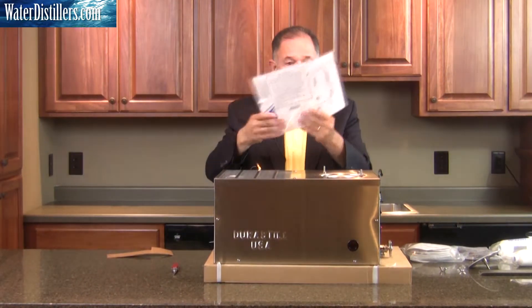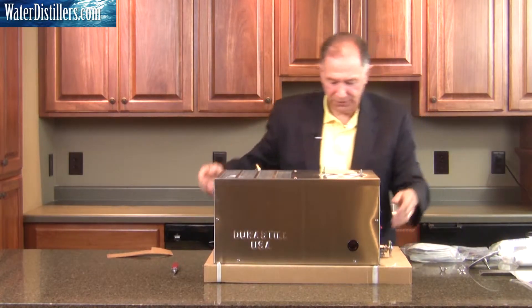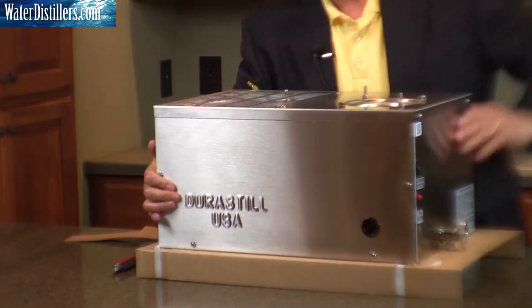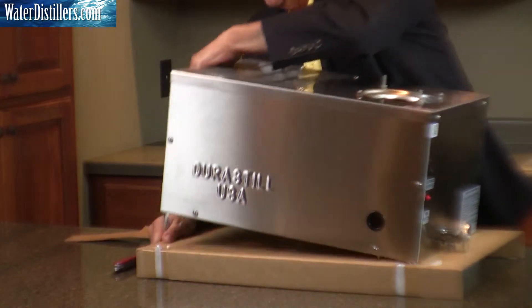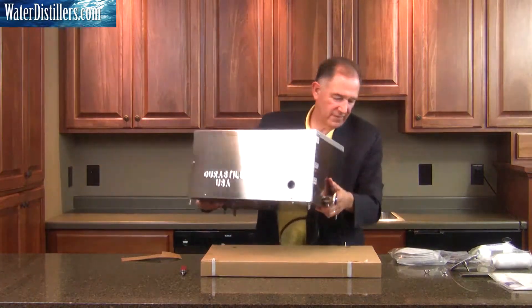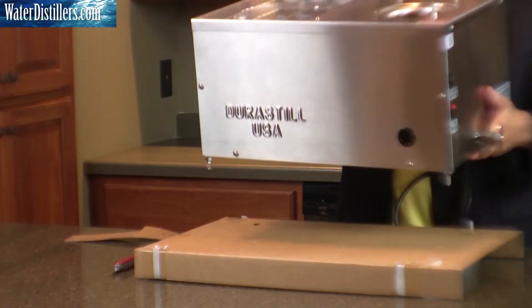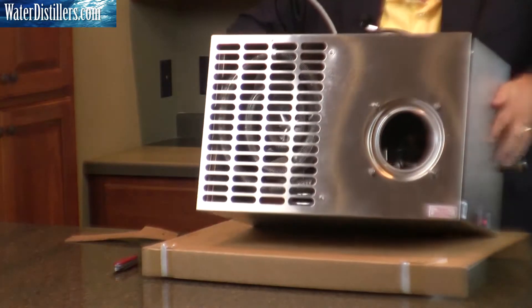You have your directions, as you see here on the very top of the distiller. Just set that aside for future use. At this point we lift the distiller off the cardboard and we have our distiller as such. Now we're going to set it aside on its side.